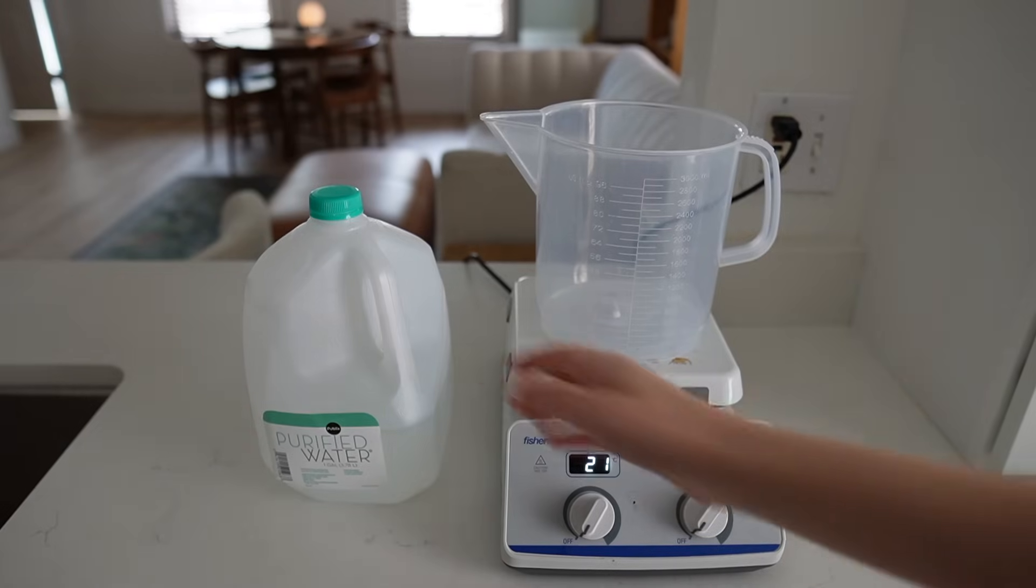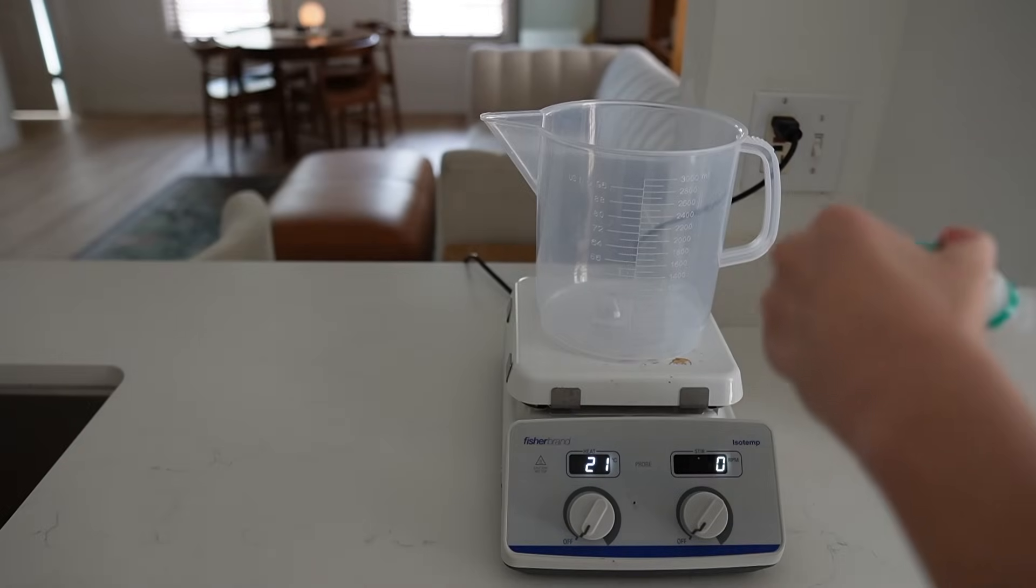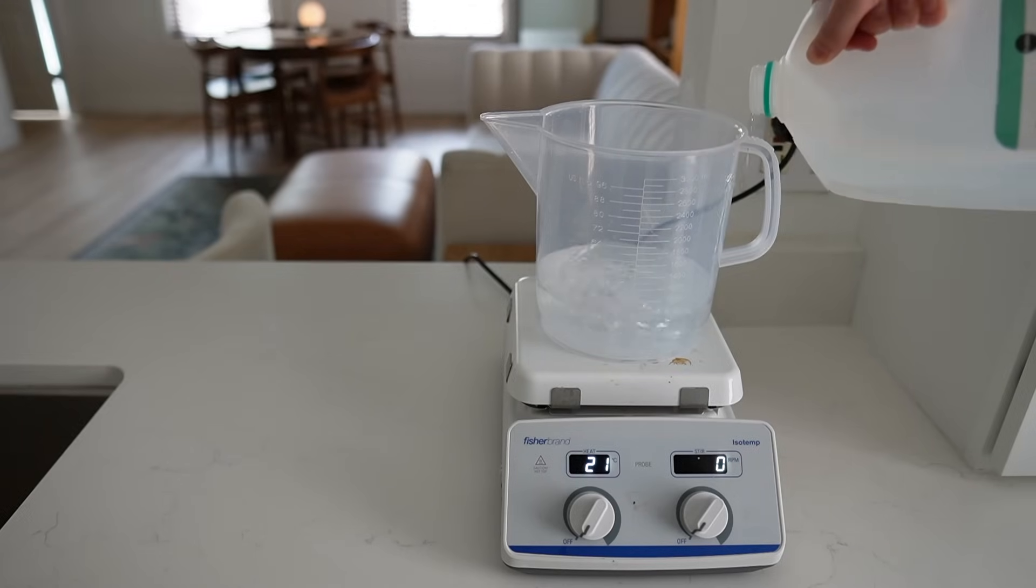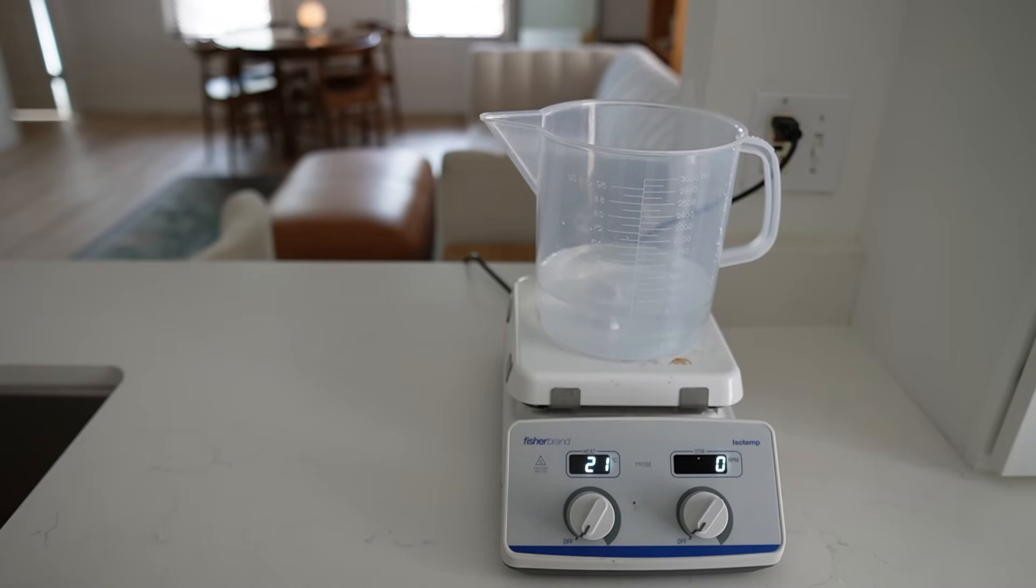Like any other tissue culture procedure, the first step is going to be for us to prepare and sterilize our tissue culture media. To make one liter of TC media for germinating seeds, I start with a container of 800 milliliters of distilled water.